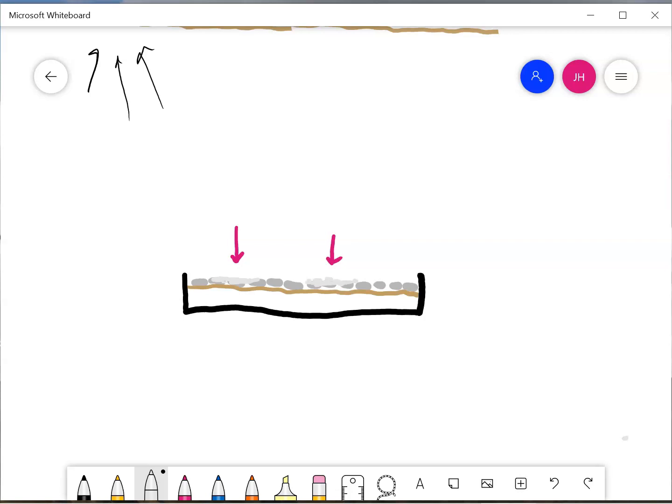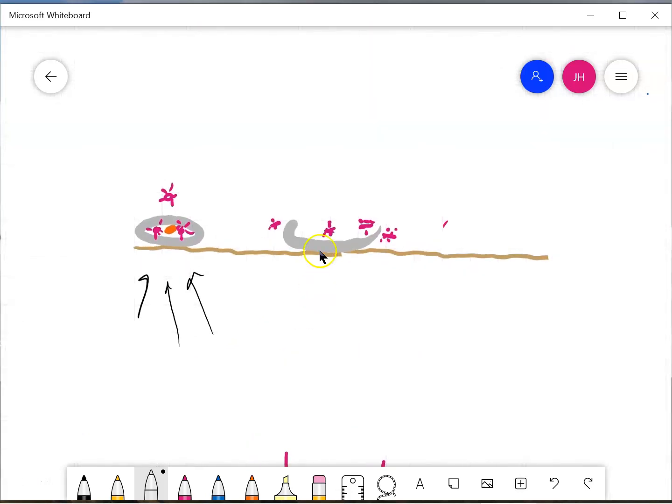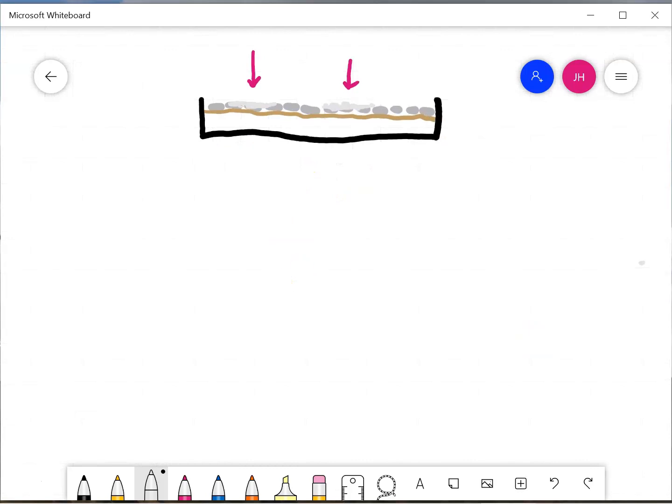And so while we can't see a virion and we can't see an individual host cell, what we can see is an area where different host cells have broken open. And we can see it because when one of these cells breaks open, the virions spread to the nearby cells and they infect the other cells nearby. And so we get an area where all the host cells have died, and that is a visible thing. So let me draw that here.